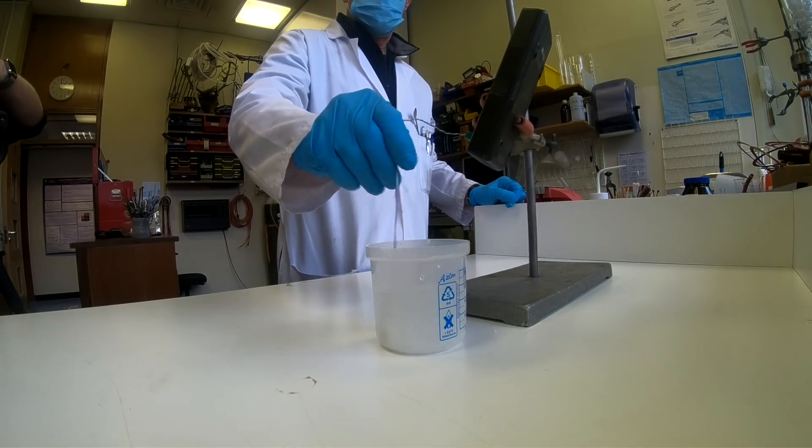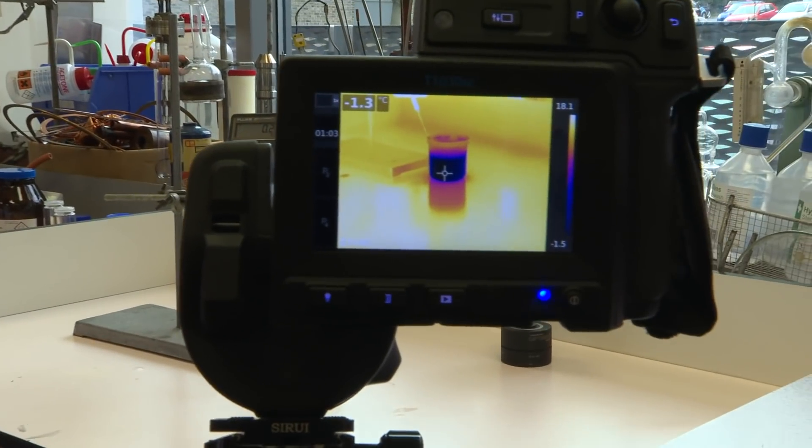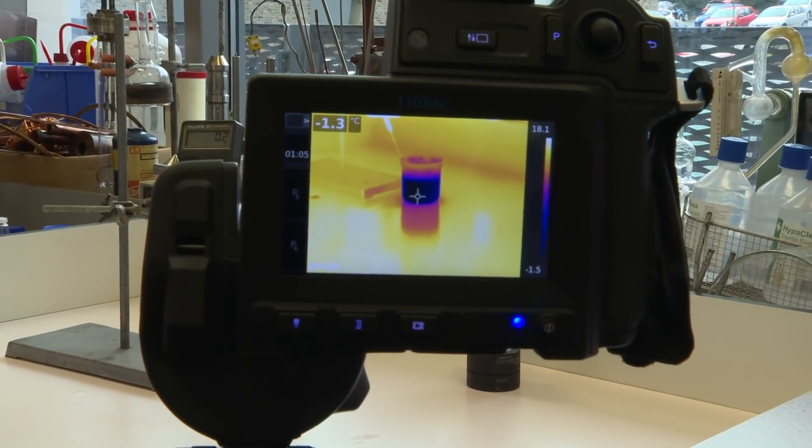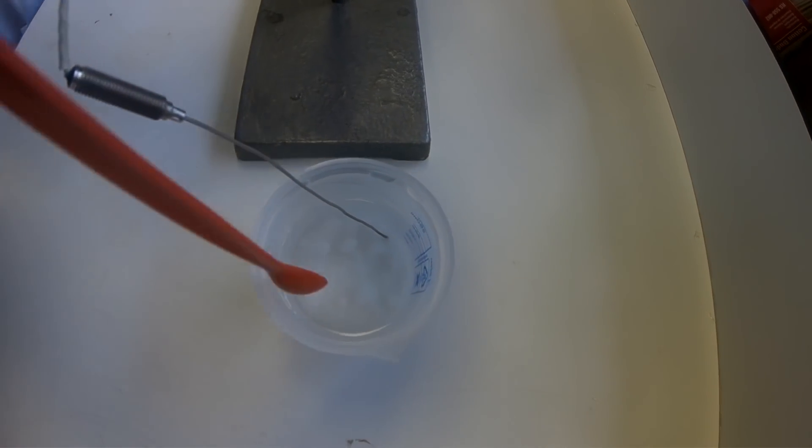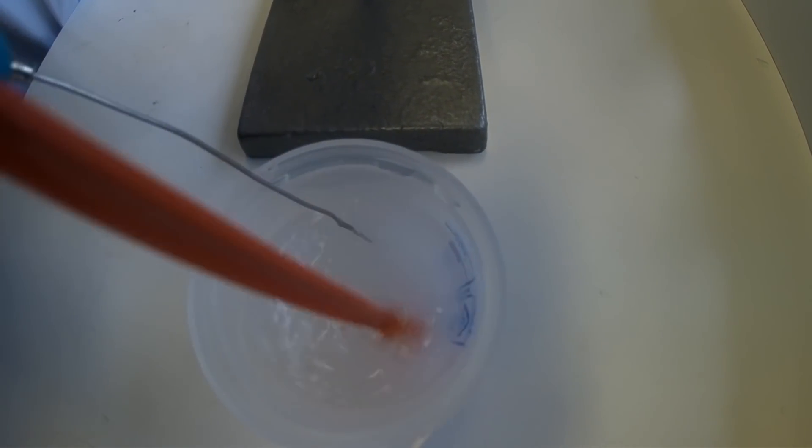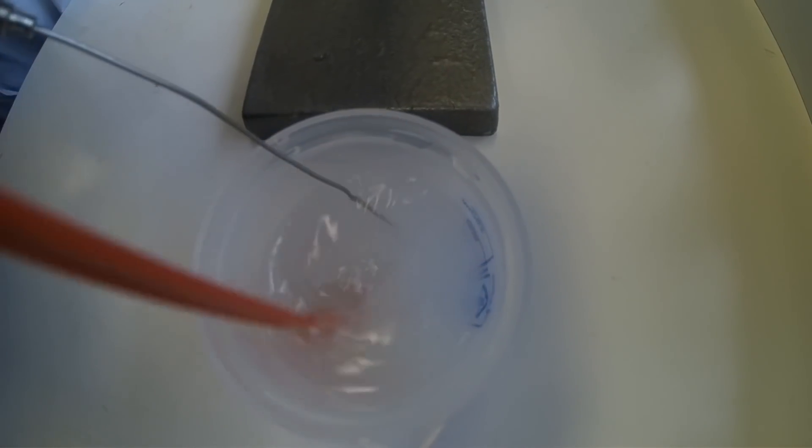But it is really quite a striking effect how this material when you put it into water can lower the temperature so much. It is just because you need energy to pull apart the positive and negative ions in the crystal.